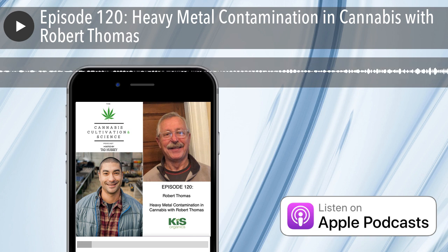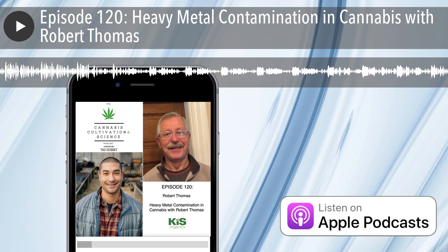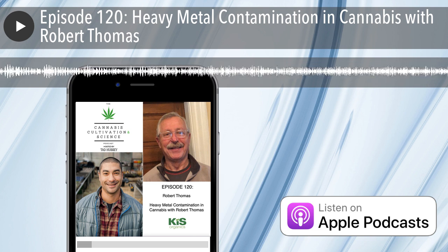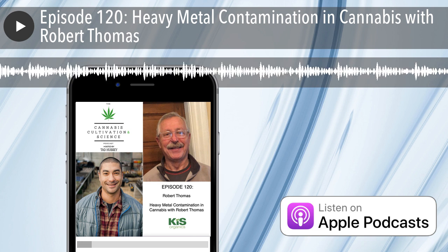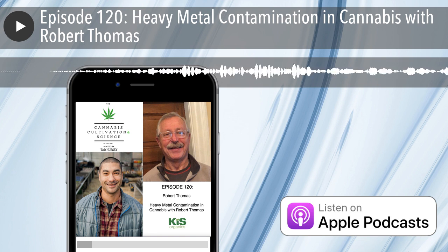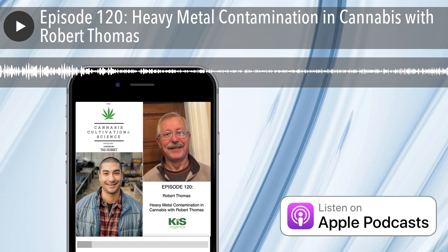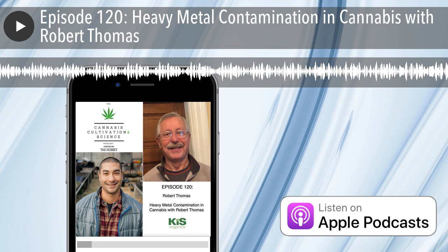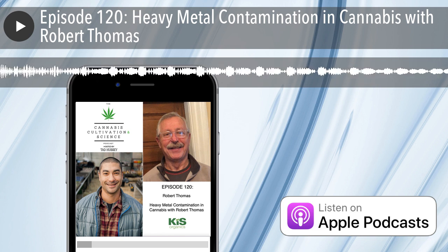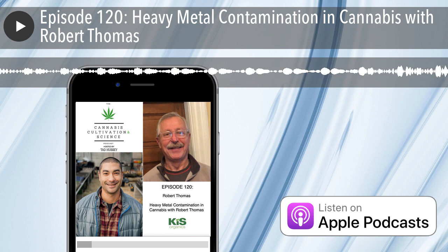I don't know how to answer that question. If you're talking about taking a small weight of the sample, typically half a gram is taken for analysis. Is that half a gram representative of what's being sampled? I don't know. I think it's unlikely that washing is going to impact that half a gram of sample that's actually taken for analysis. And I think growers do a reasonable job of getting the sample in a convenient form for testing.